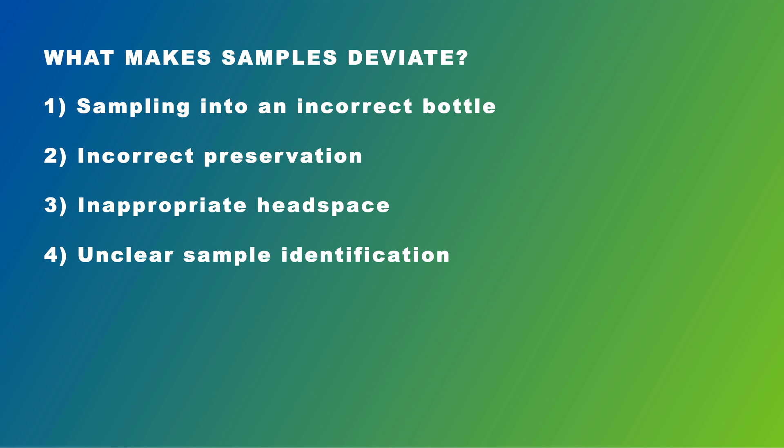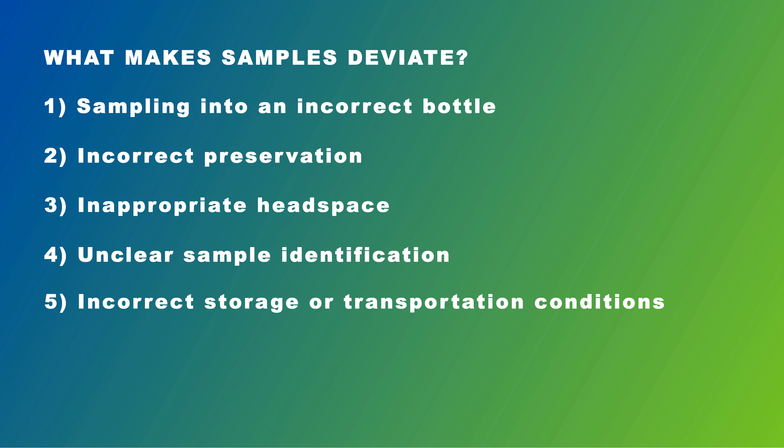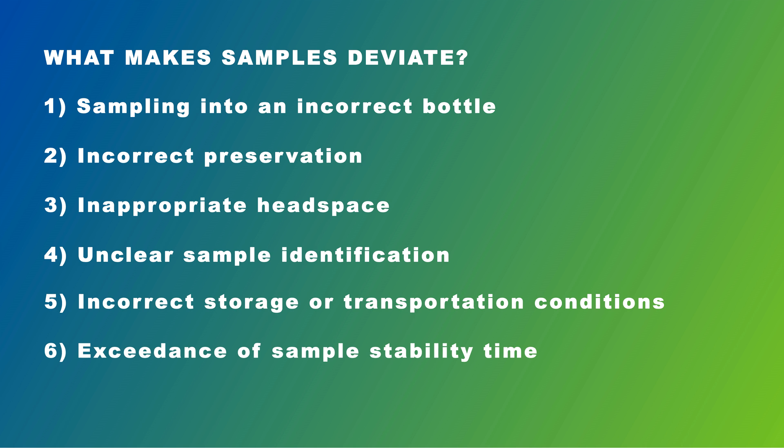Further causes of deviating samples include unclear sample identification — for example, when sample labels and/or paperwork don't bear a date and time of sampling — incorrect storage or transportation conditions, and exceedance of sample stability time. Please note that although this list is long, it's by no means exhaustive.